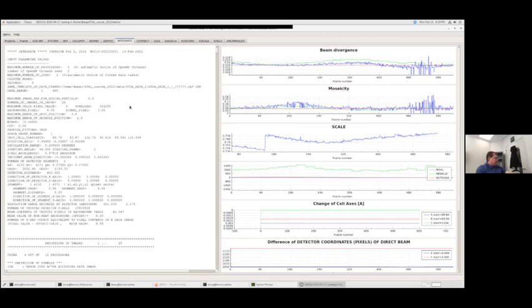So that's basically what we look at on Integrate, is just these graphs. Are we seeing sharp spikes or oscillations? Are we seeing wild swings in the values? What we want is nice and smooth with minimal jumps. So overall this looks pretty good. I might go back in and process without using this range of data from 480 to the end of the data set, perhaps. So then we move on to Correct.